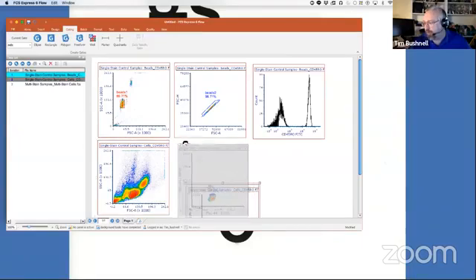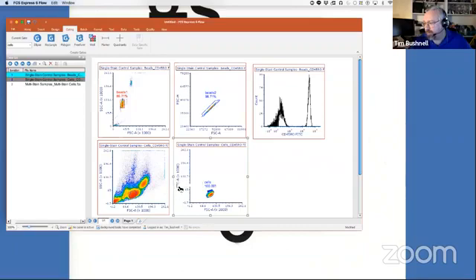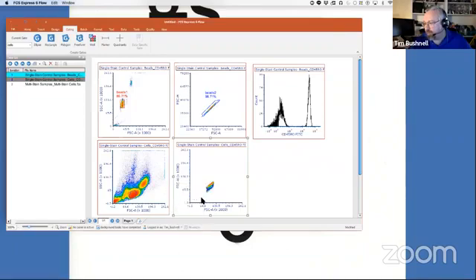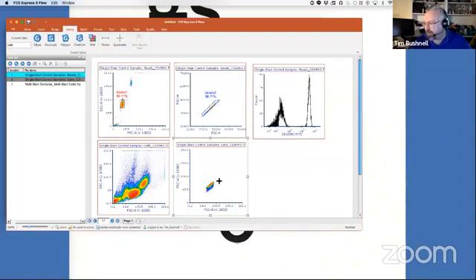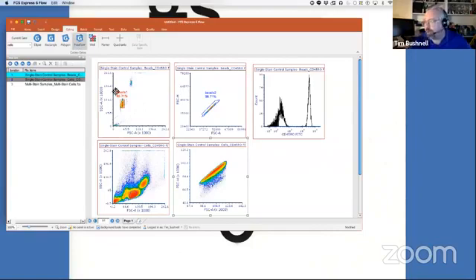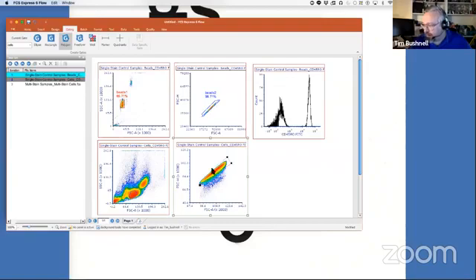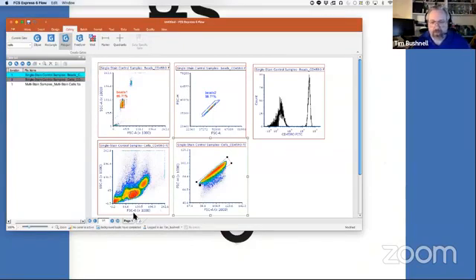And again, we'll bring this up and we're going to take a look at, make sure we've got singles. Again, I'm going to use that trick. I'm going to magnify the resolution because you can see there's a lot of stuff right here that we want to get rid of. We don't want to use the tighter we are, the better. So here's our second cells.